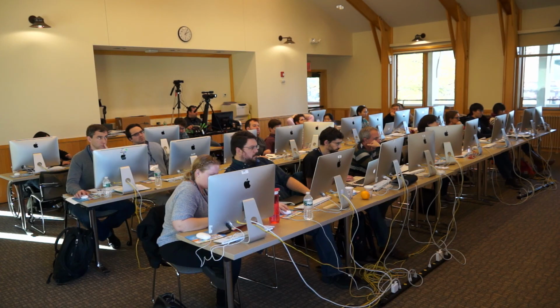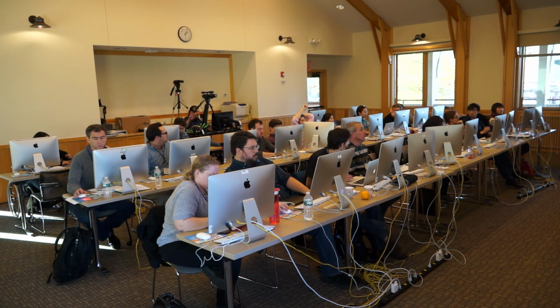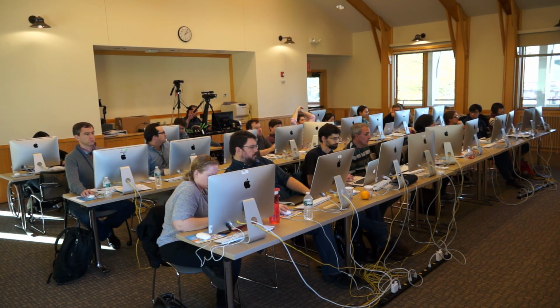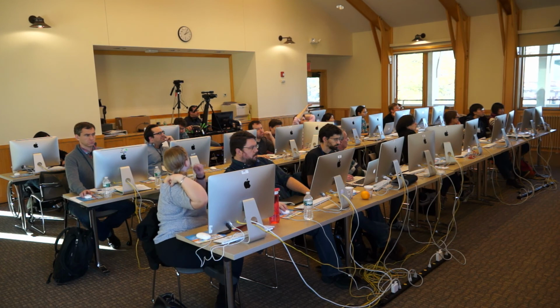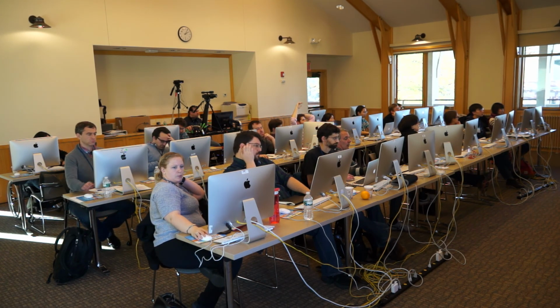So can you define your own phenotypes to use this software? If you took all your gene stocks and rank ordered them or gave them a score about how curly they are, any random phenotype you want to define, can you then go back and use this to try to correlate that with, say, exome capture or something? Or would you need to have those phenotypes somehow structured in an ontology to be able to use this tool?